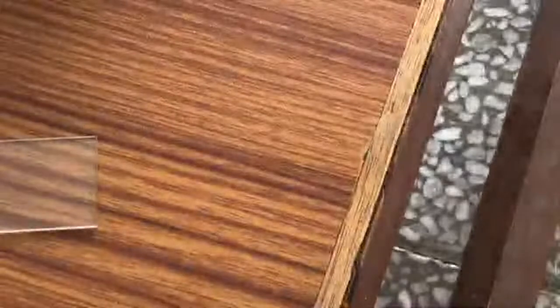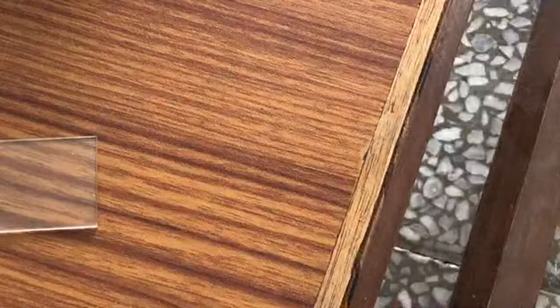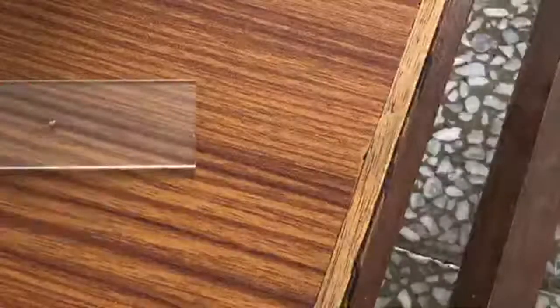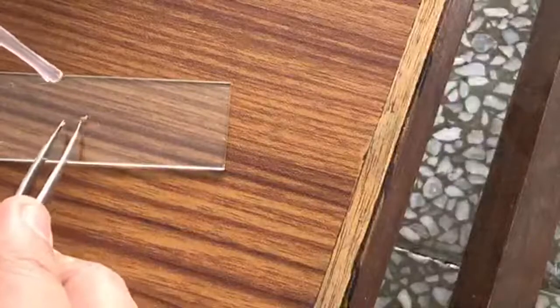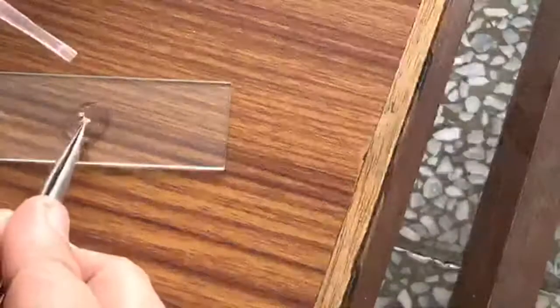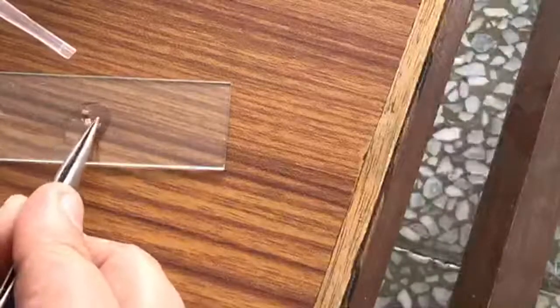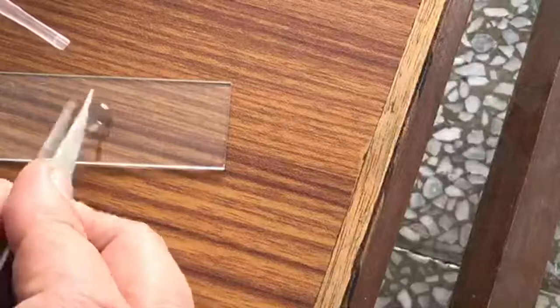I'll take a dropper and add a drop of water to this. I hope you can see it here. So we take a drop of water, and I'll wash the forceps here, and also spread this little whitish thing that we have.